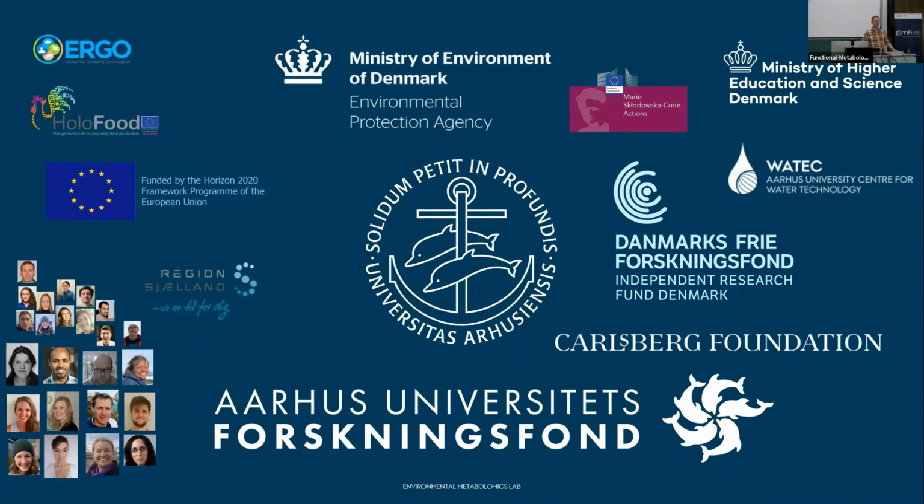And that is, Molato, how is it going with that work? So checking whether they are giving the same outcomes or not, I'm still working on it, but it seems that they are somehow related. Yeah, comparing the TraceFinder data and the semi-quant data. And the real advantage of the semi-quant is to apply it on level 2 and level 3 data, because you could do the quantification on your level 1 already yourself. It takes a longer time, but then you can also feed that into the model.